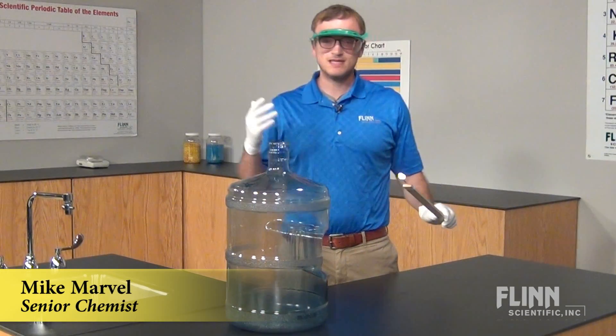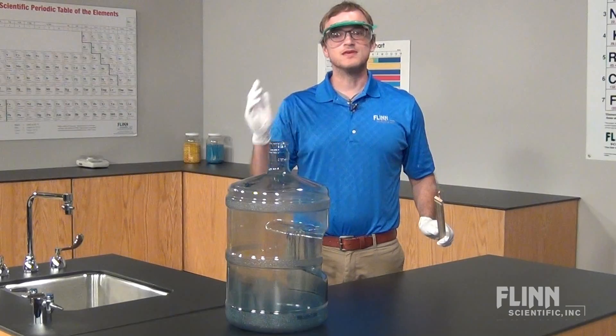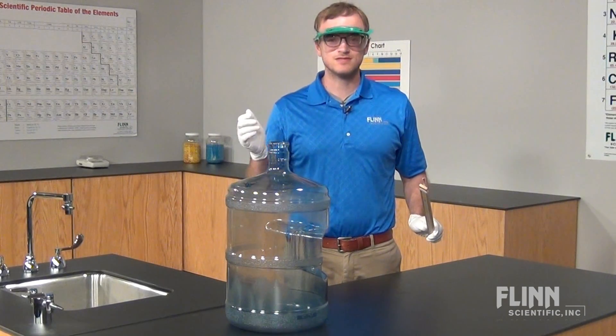That's fun every time. A big demonstration like this must be done safely. Follow these simple woosh bottle safety tips to keep you and your students safe.